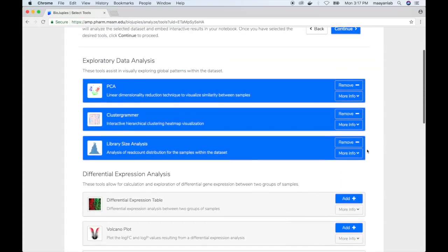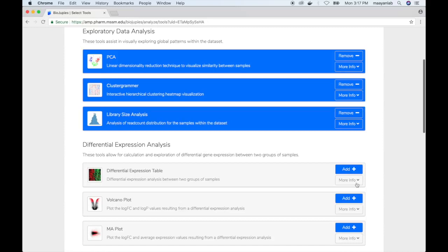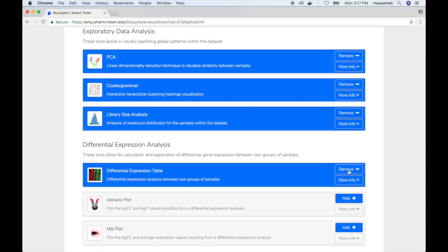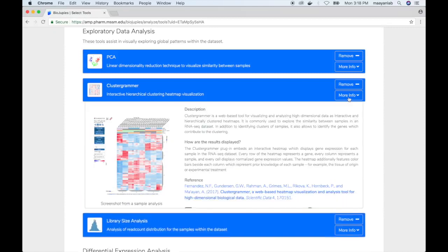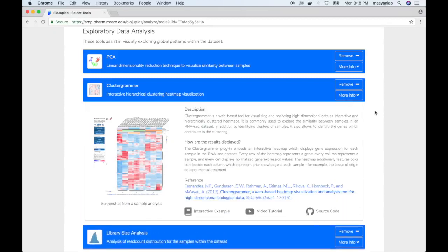The user can add or remove each of these tools by clicking on the buttons on the right. An option will reveal more information about each tool, including a brief description, links to references, interactive examples, video tutorials, and the source code hosted on GitHub.